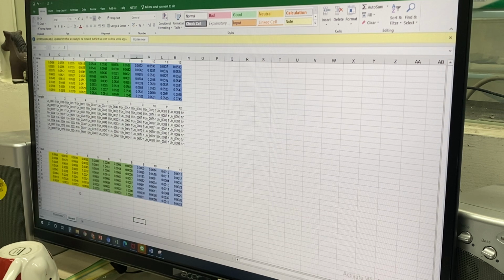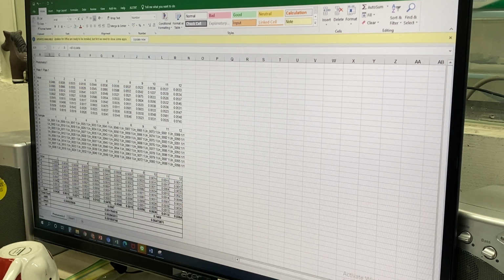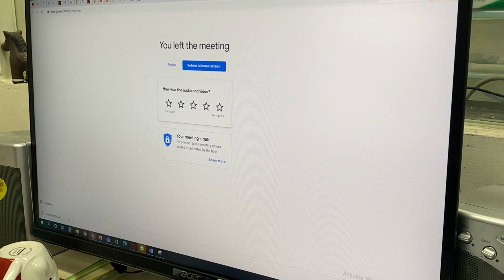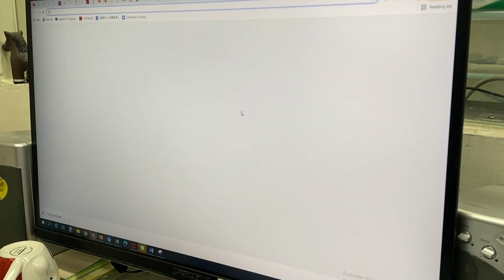Okay? So now what you want to do, you have to do the total sum, okay? AMR. AMR means average metabolic rate, okay?